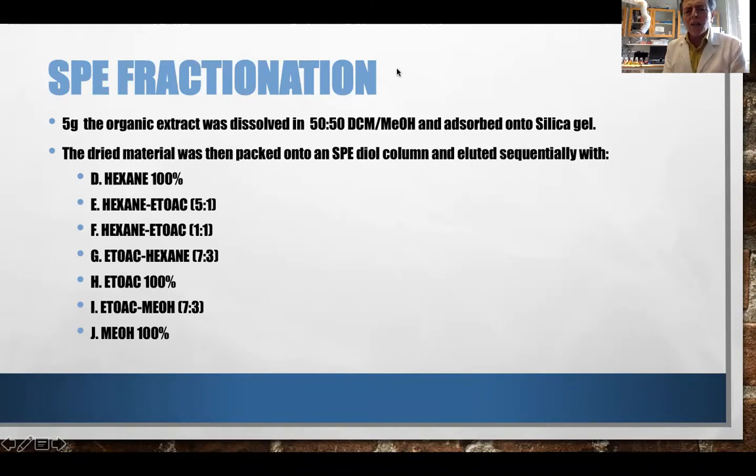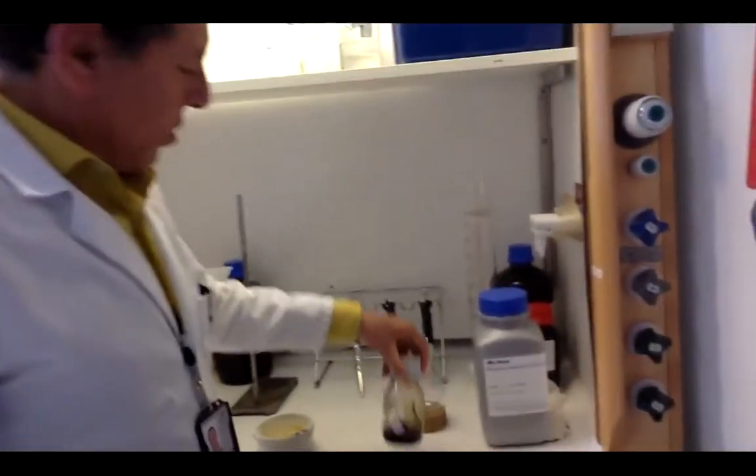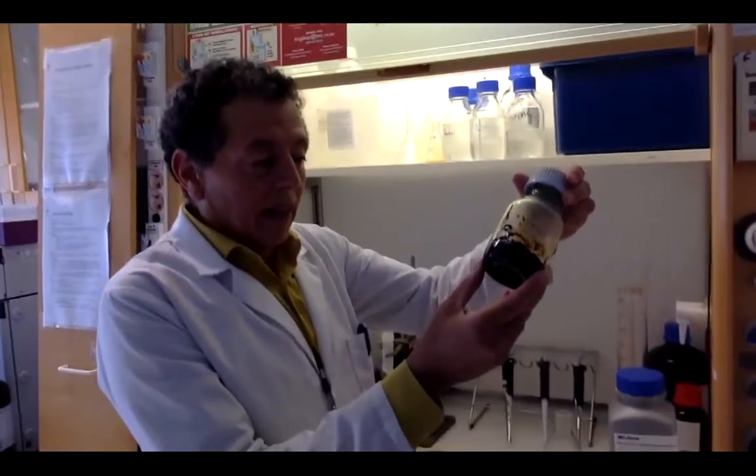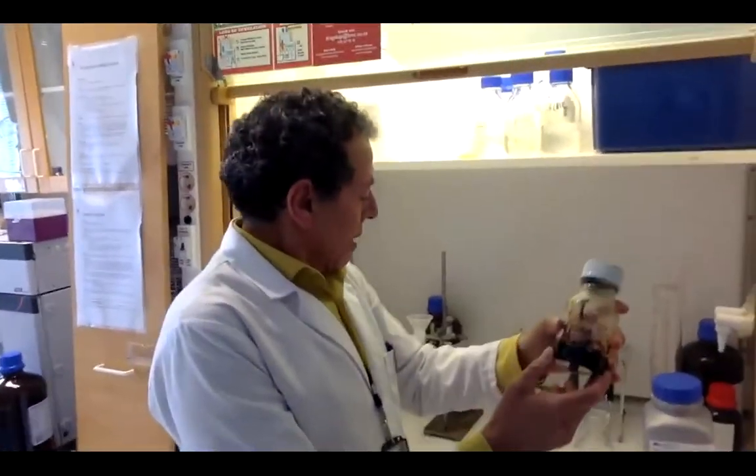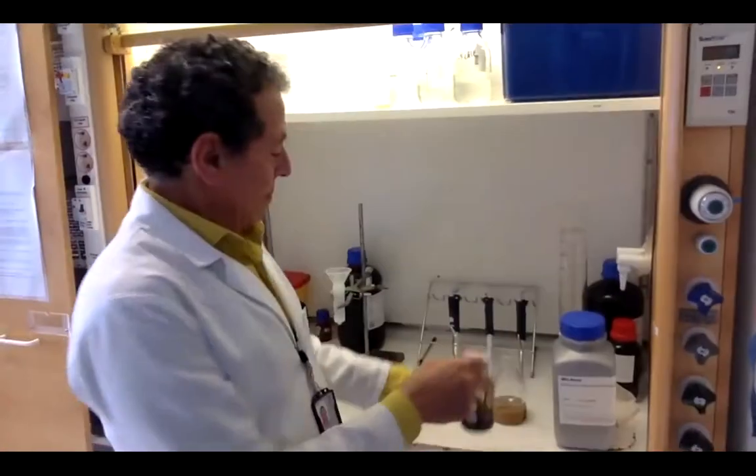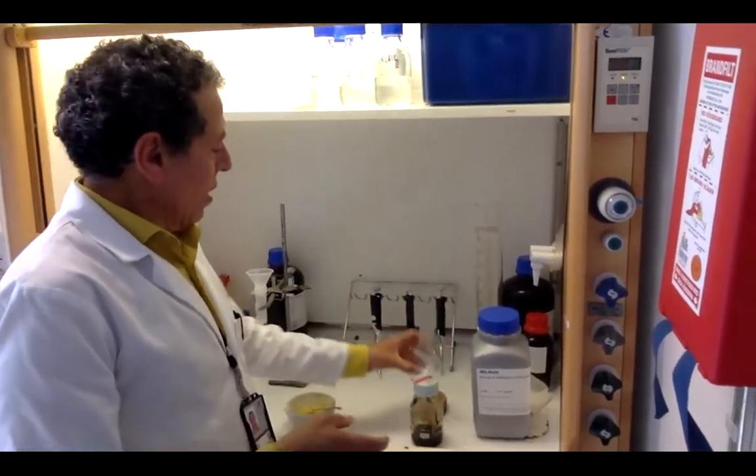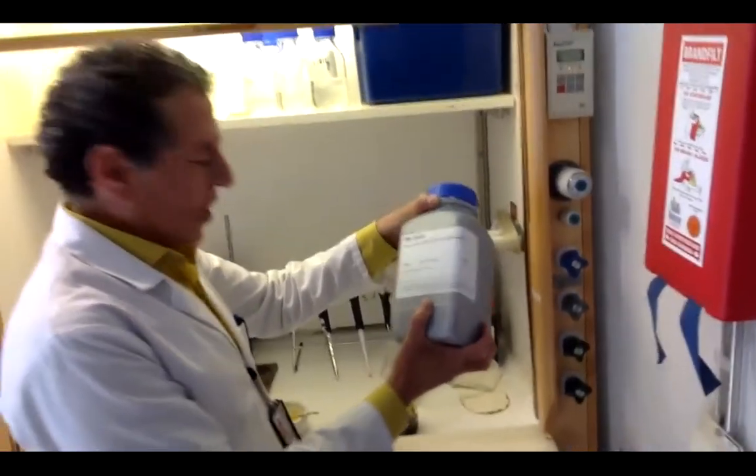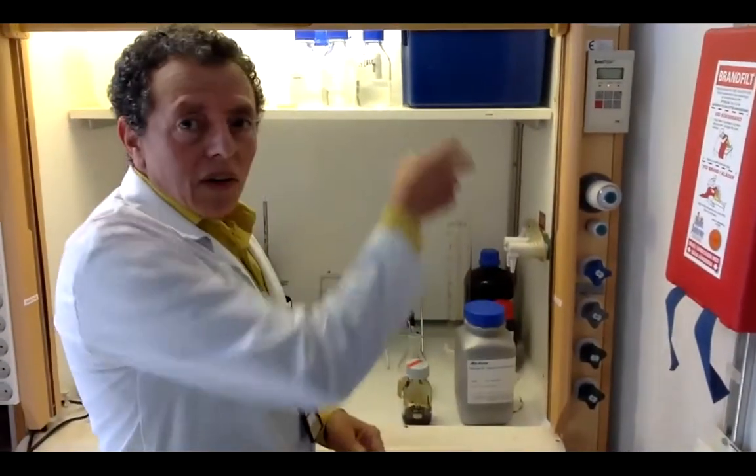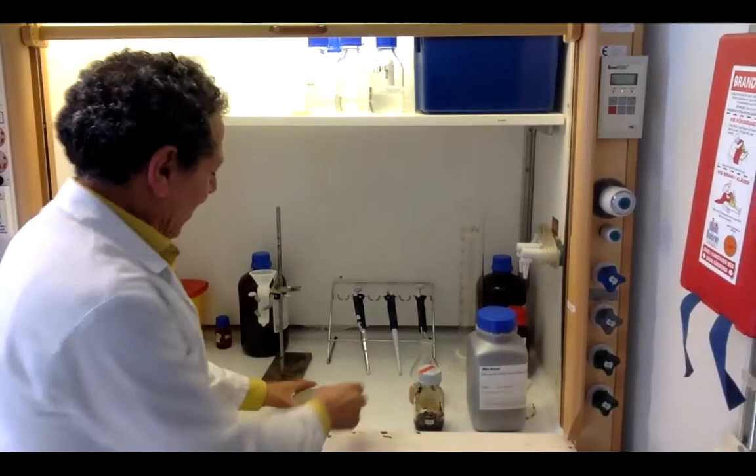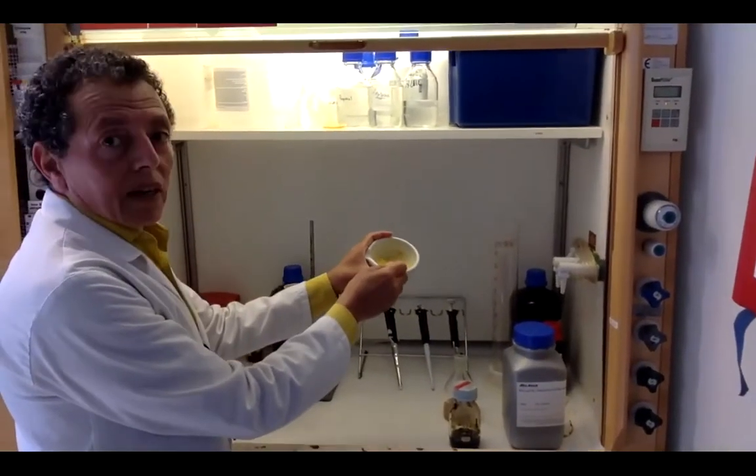Let us start the lab work, which I think will be very enjoyable. Here we have the organic extract, which in our case is DCM-methanol. We take 5 grams in a round-bottom flask, dissolve it in DCM-methanol, add 8 grams of silica gel, then use a rotary evaporator to get the dried material like this one.